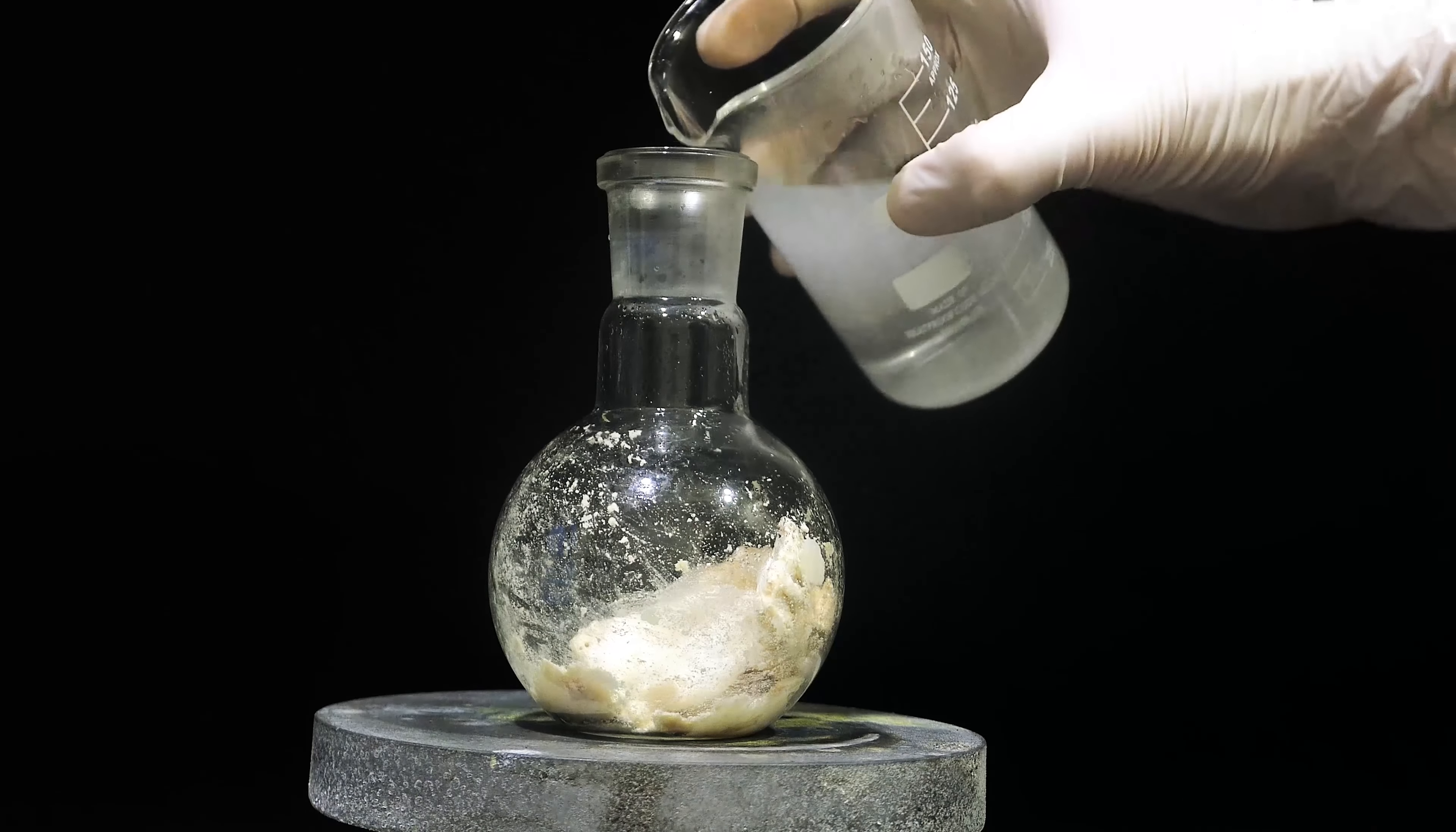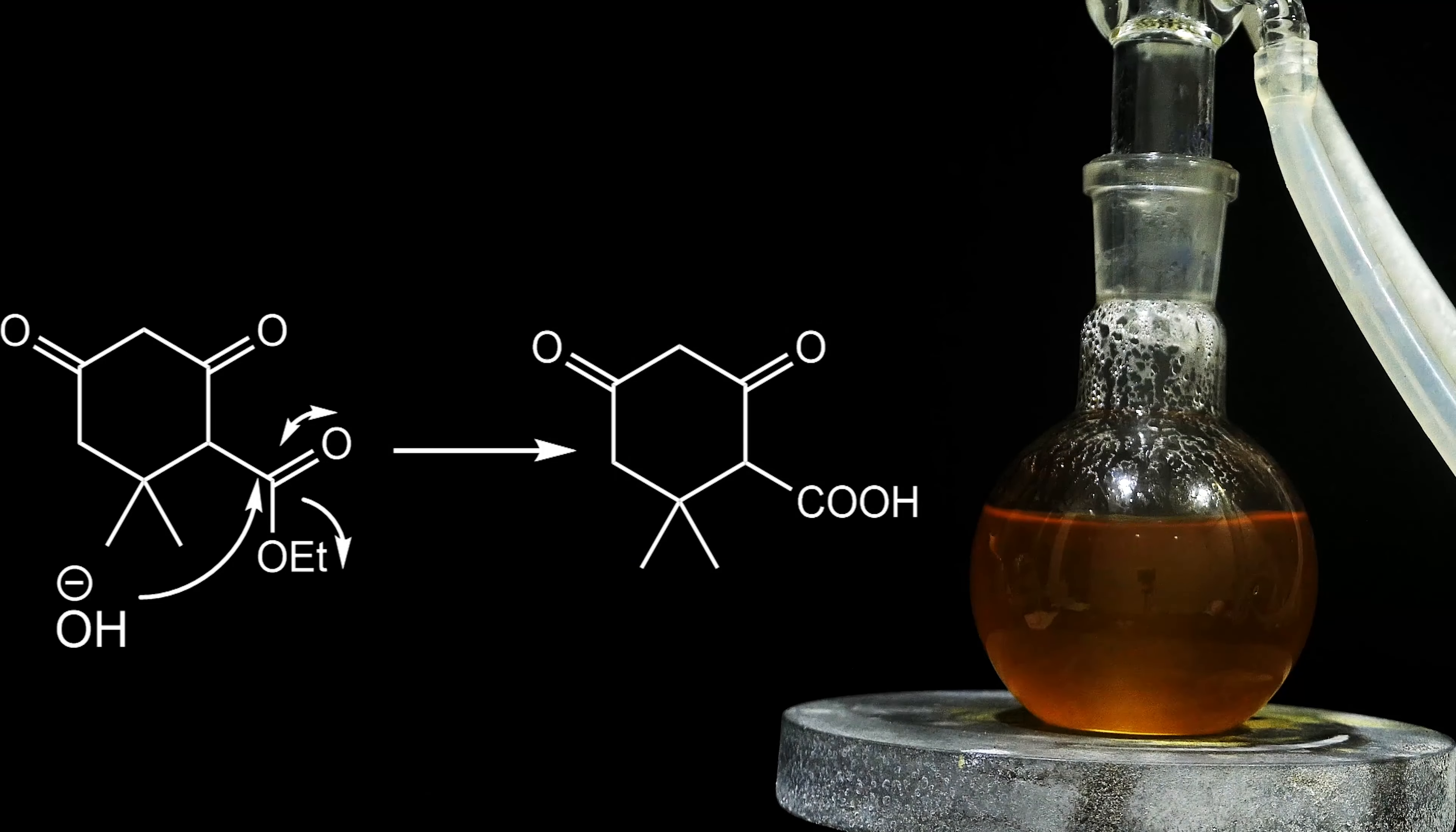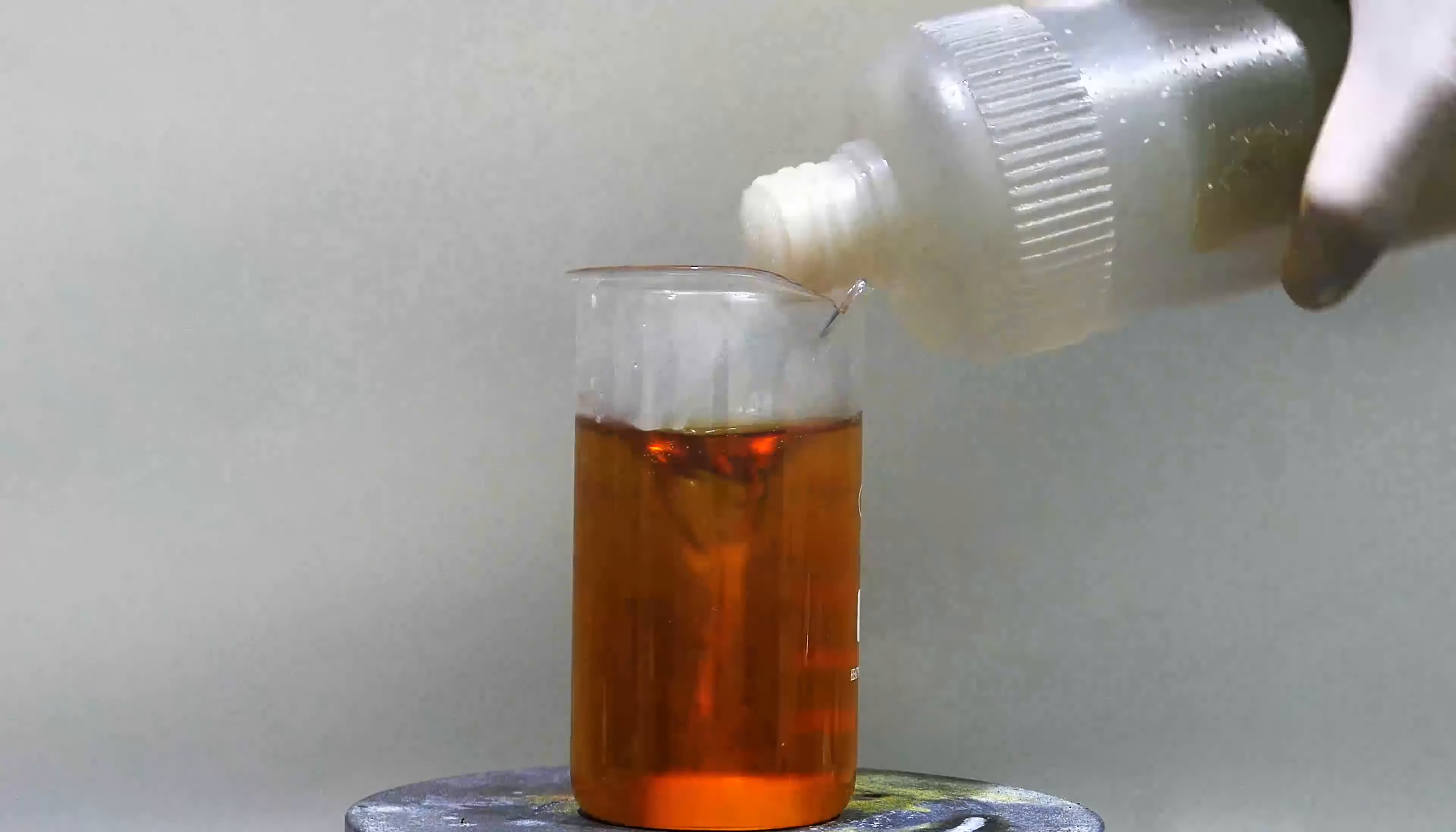I instantly dissolve this yellow cake by pouring in 100 milliliters of 3 molar sodium hydroxide solution. Next, reflux the solution for 2 hours to hydrolyze all the intermediate ester. This step is followed by acidification, simply adding concentrated hydrochloric acid until pH reaches 1.